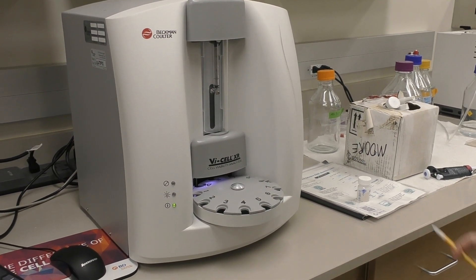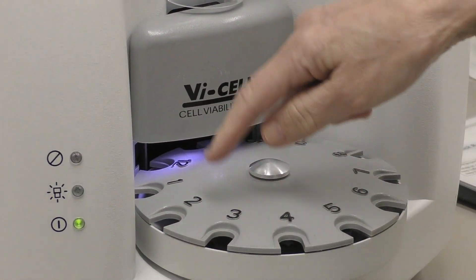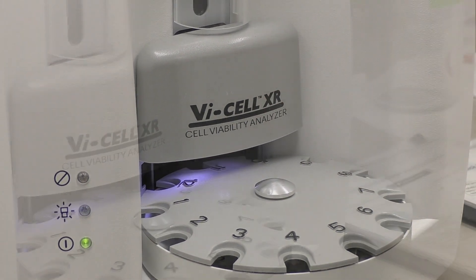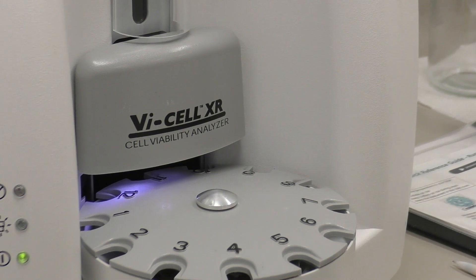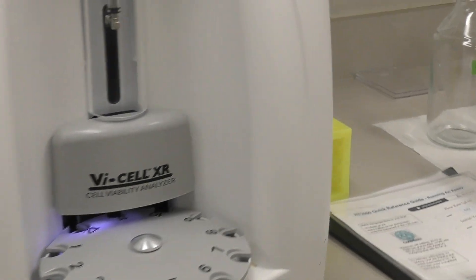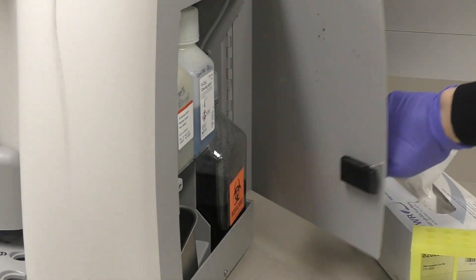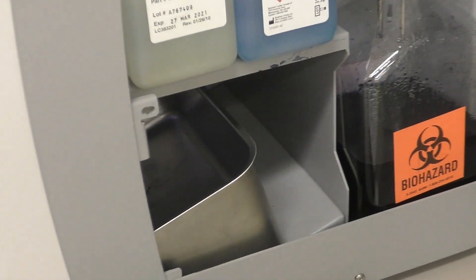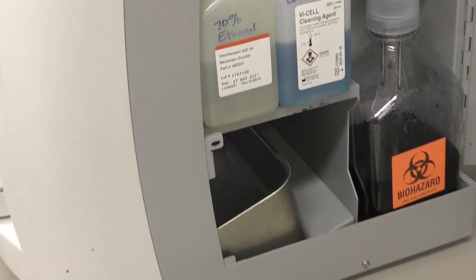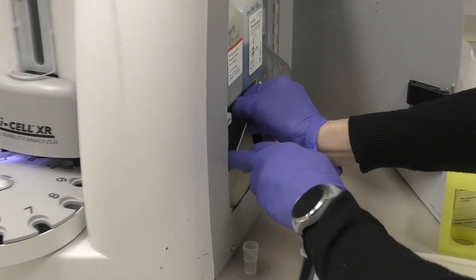Some things that could go wrong: sometimes the sample cup will get stuck and the carousel will try to keep turning and make a buzzing sound. In that case, the waste bin is probably full and needs to be emptied, and that will unstick the sample cup. Open the waste door on the side — the waste bin is the metal bin. Just remove it, empty it in the biohazard trash, and then replace it.